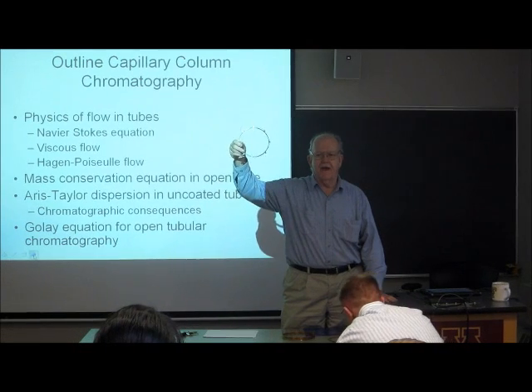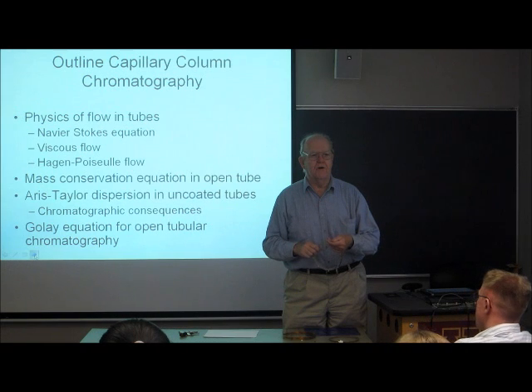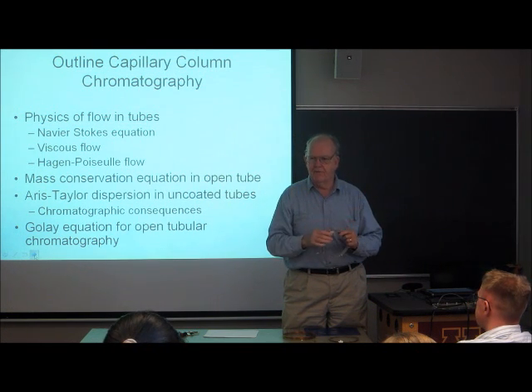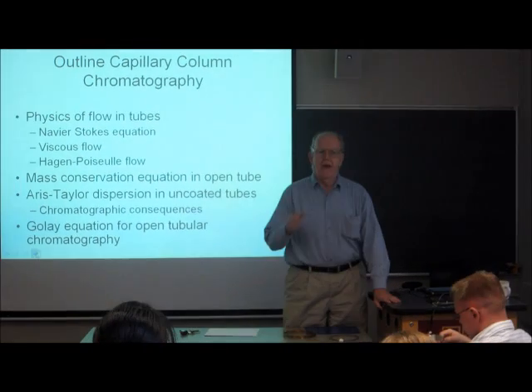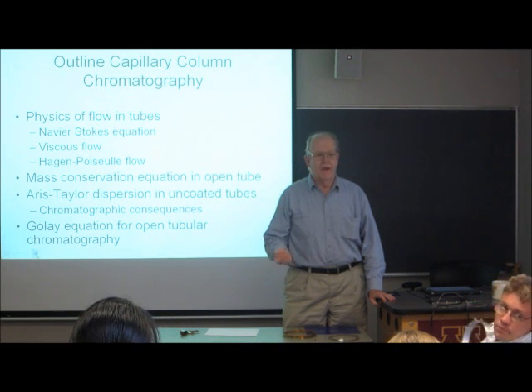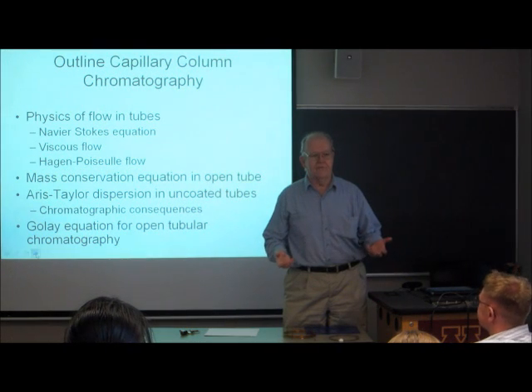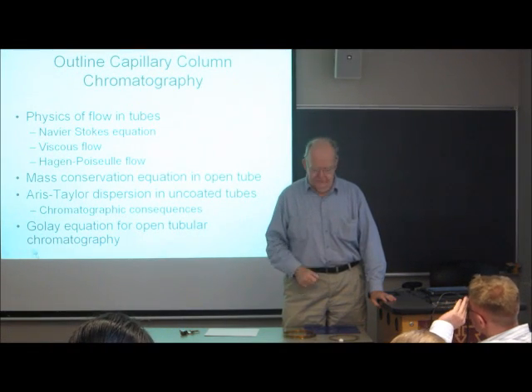This is a stainless steel capillary. The wall of this tube is coated with a stationary phase. It's not filled with particles. It's simply the interior wall of the capillary has a very, very thin film of stationary phase on it. The state-of-the-art advanced from this metal tube, but the metal tube has the advantage of not being terribly breakable, but it's heavy. And it was really hard to do good temperature programming because it's so massive that you just couldn't get a lot of heat into it real quickly.